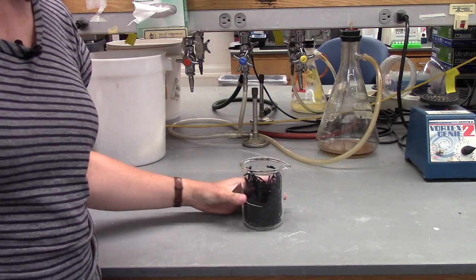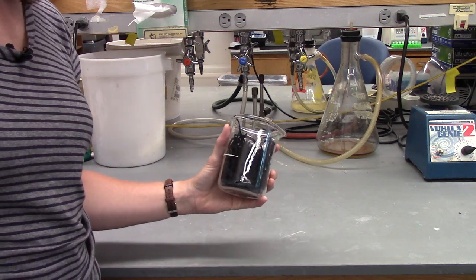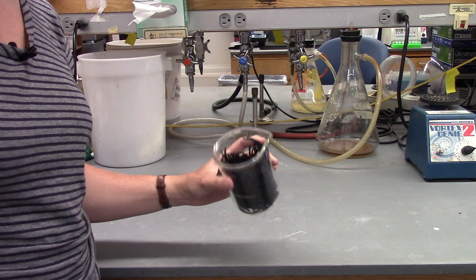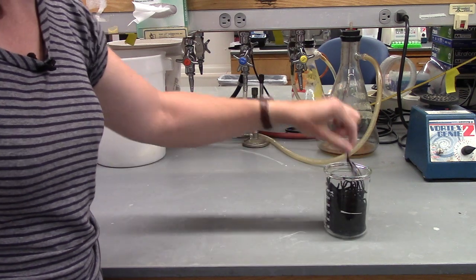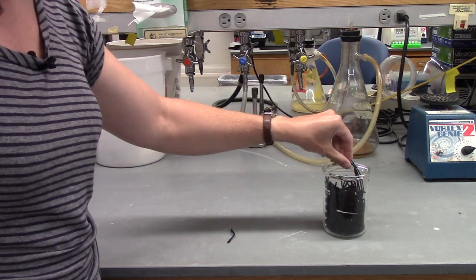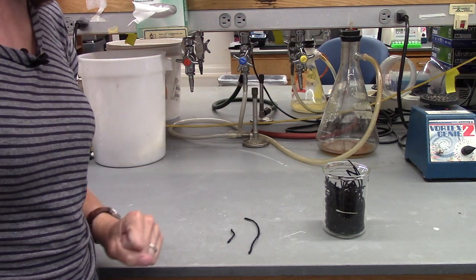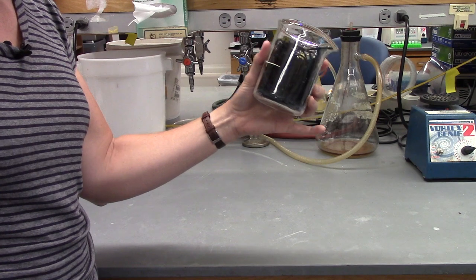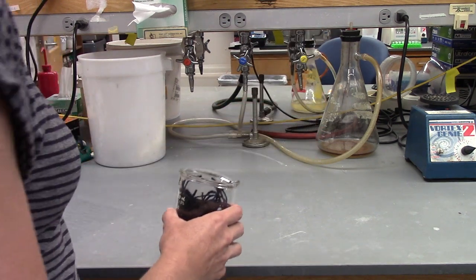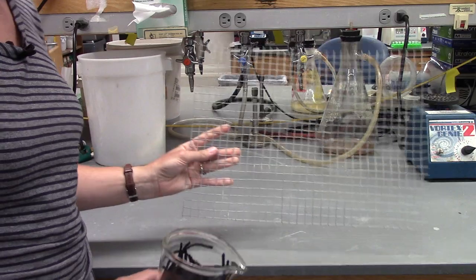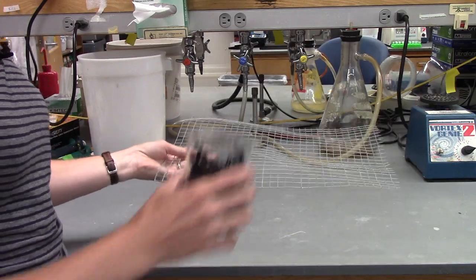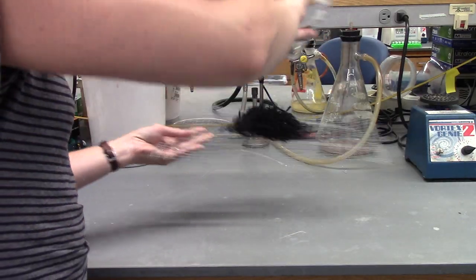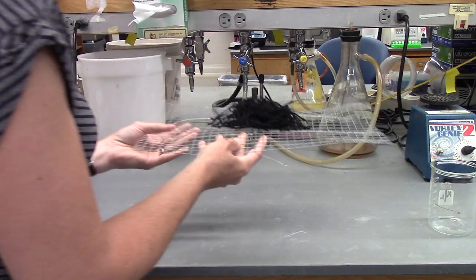It works essentially like this. Imagine that this is a PCR tube full of pieces of DNA. And in this tube, I have two lengths of these pieces of DNA. I have short ones and long ones. So, what I need to do is I need to tell whether all the pieces in this are long or short or both. And so, I'm going to put the pieces of DNA on a mesh. I'm going to use a hardware cloth in this case. So, I'm going to pour my yarn, my pieces of DNA, on the mesh.